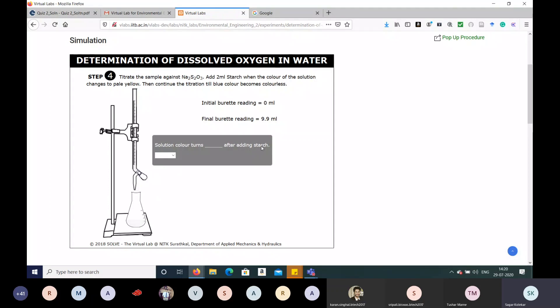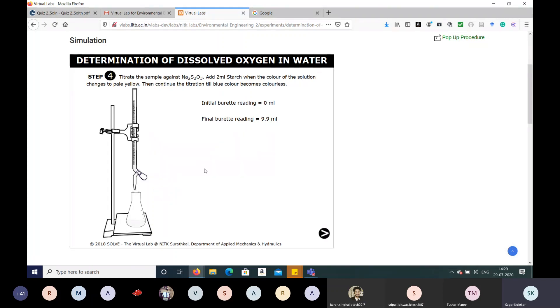The question asks: what color does the solution turn after adding starch? The answer is blue — that is correct. The burette reading obtained from this standardization titration is 9.9 mL.